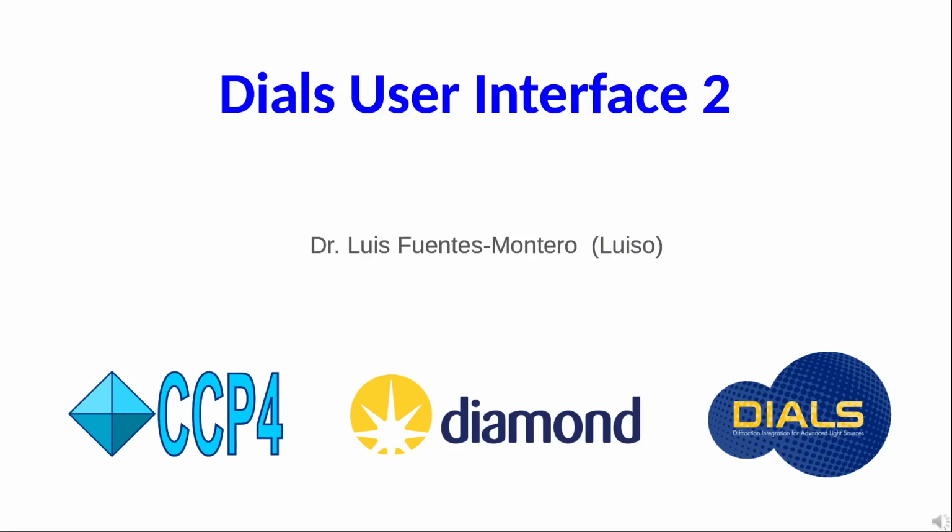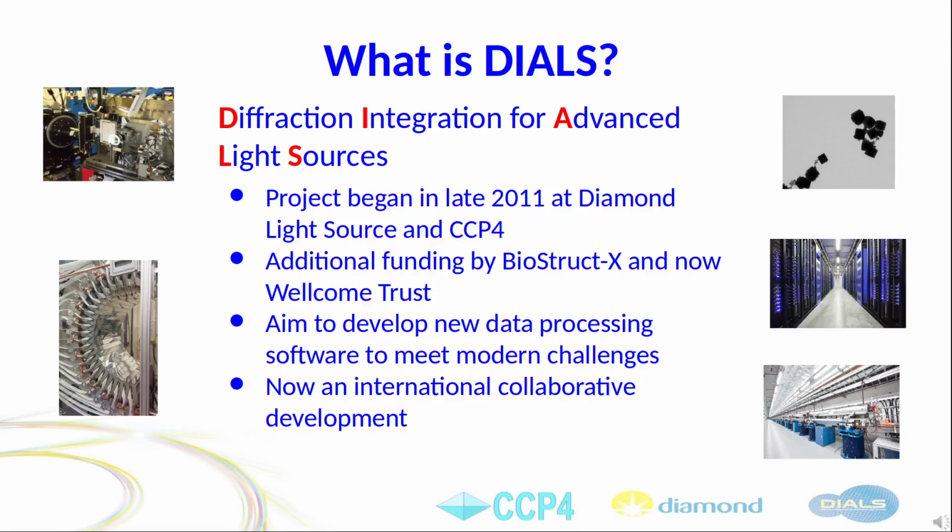And now I would like to talk to you about DIALS user interface version 2, which will be released very soon. Before talking about DUI, I should say what is DIALS. DIALS is a software project to integrate data from diffraction images.